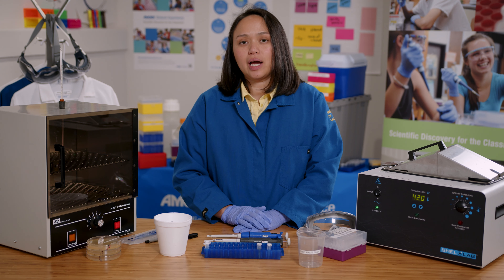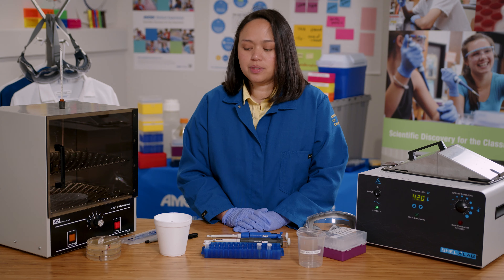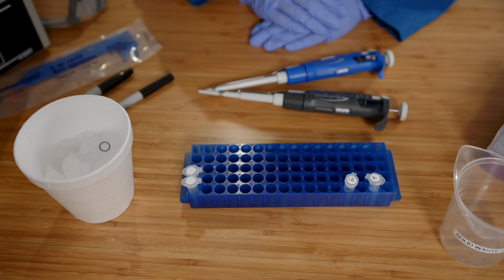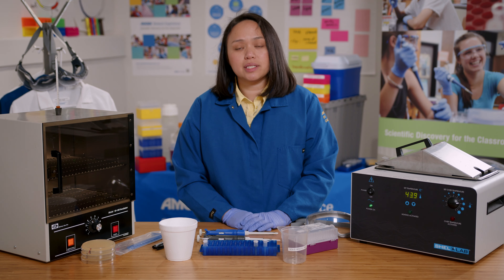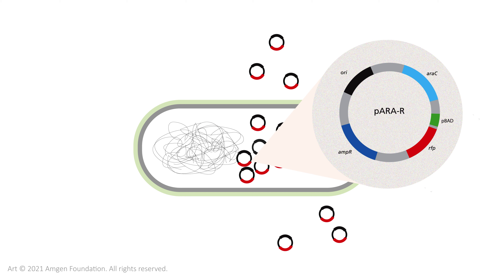Here are the reagents and equipment I will use to conduct lab 5a. I will start off with two tubes, competent cells, and the plasmid. The competent cells are E. coli cells that have been specifically prepared to take up the plasmid. The plasmid is the same plasmid I digested and confirmed that the genes of interest are present.